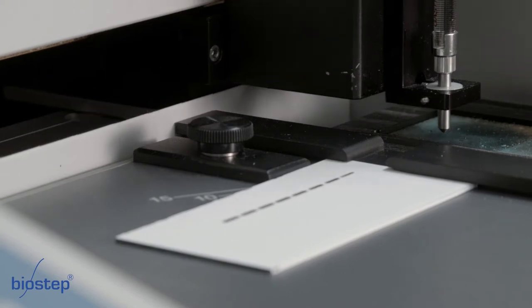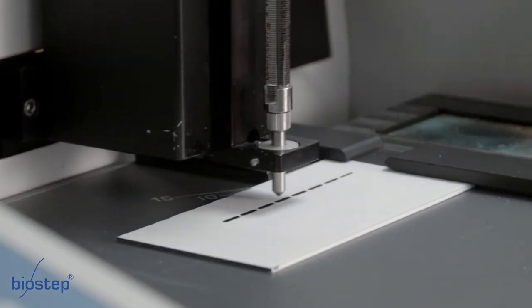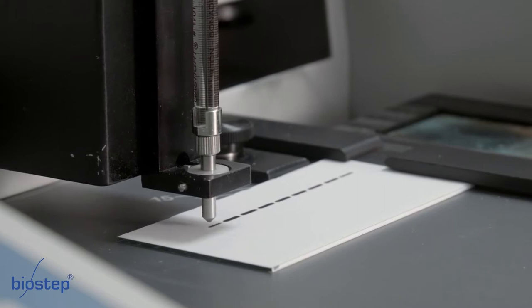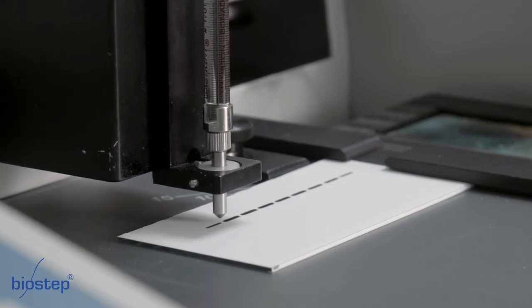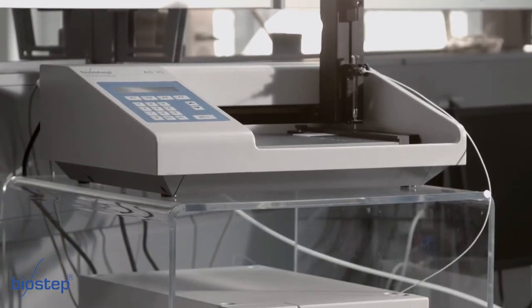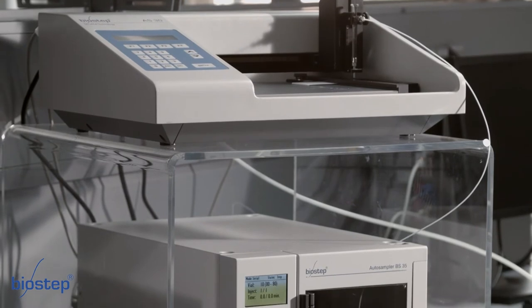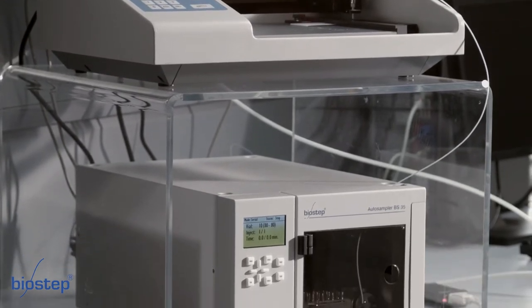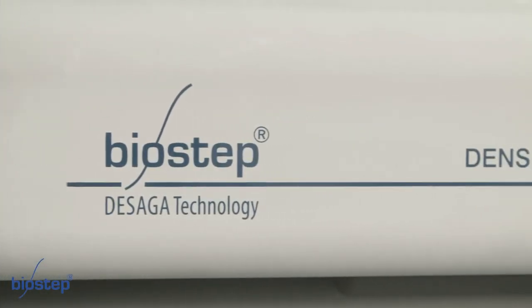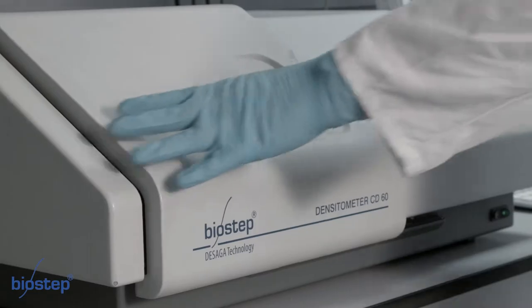Do you still apply your TLC samples laboriously by hand with capillaries? It is more easy and professional with the HPTLC applicator AS30, especially in combination with the auto-sampler BS35. The professional and quantitative analysis takes place with the HPTLC densitometer CD60, which is presented in another video.